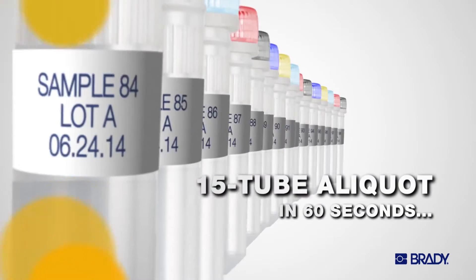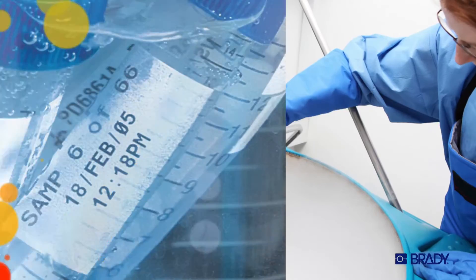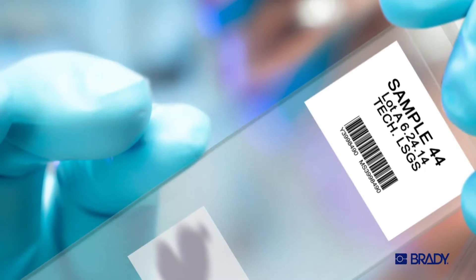Because a pen won't give you a 15-tube aliquot in 60 seconds on some of the toughest labels around, designed to withstand the extreme conditions in your lab.